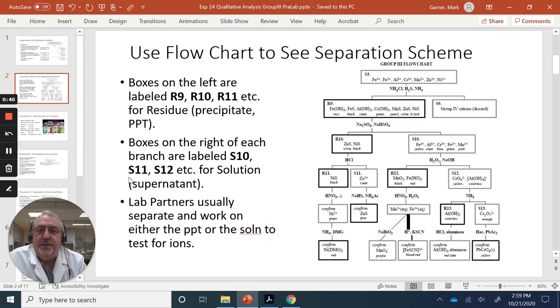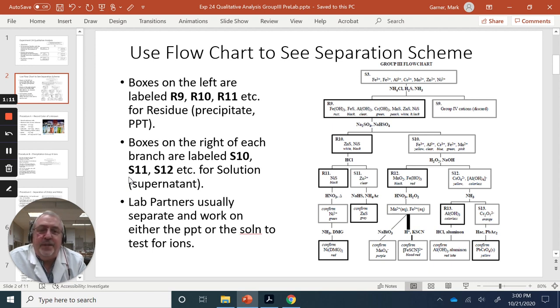The separation flow scheme for today is quite more complicated in the second qualitative analysis lab. The residue or precipitate side is shown with R groups like R10, R11, etc., and the solutions or supernatants are labeled as S10, S11, S12, etc. When we separate these branches, one lab partner would work on a particular ion for confirmation.